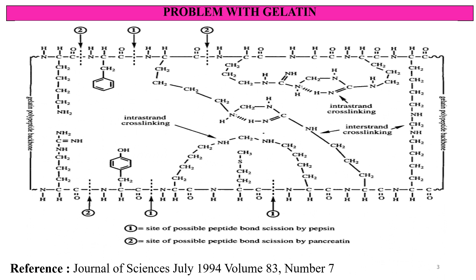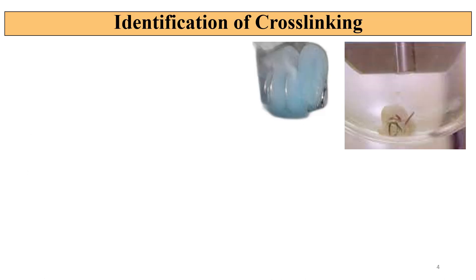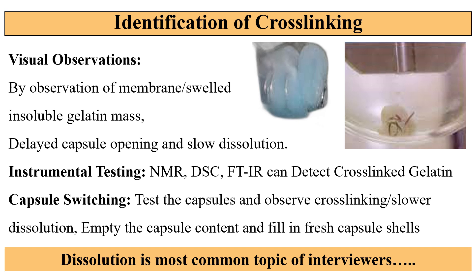The main concern with gelatin is that crosslinking causes a membrane-like structure to form. Here is the membrane-like structure, which is insoluble — also called pellicles. Due to pellicles, the dissolution rate gets slower. Crosslinking can be identified through visual observations by observing the membrane or swelled insoluble gelatin mass, delayed capsule opening, and slow dissolution.